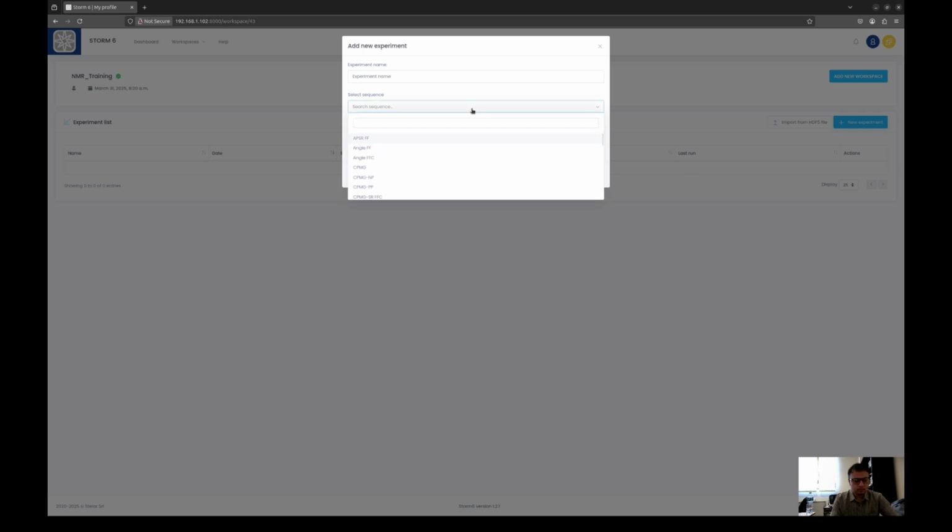Whenever we perform an NMR experiment, the first part is to make sure that we have the proper working conditions and our probe is properly tuned. To do this, I will create a new experiment, which I have named resonance tune. The sequence I will select for an FFC instrument is non-polarized. This is a single block non-polarized sequence. We can also use pre-polarized, but I generally prefer to use the non-polarized sequence.